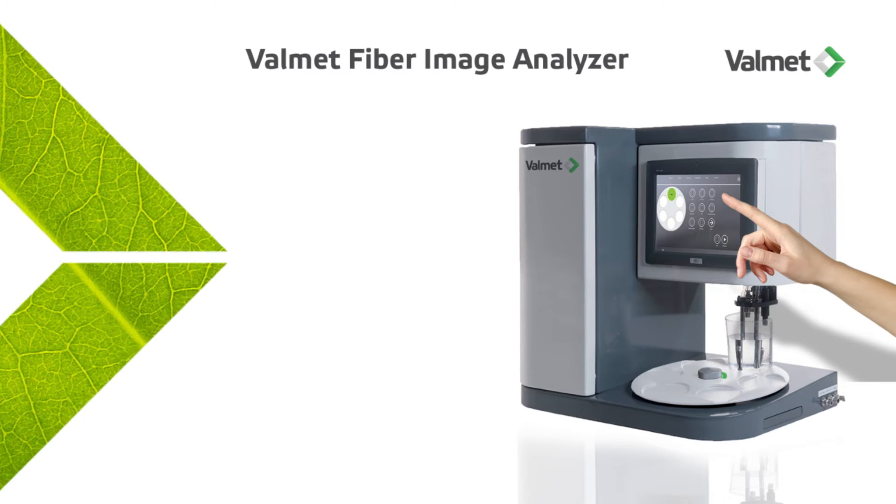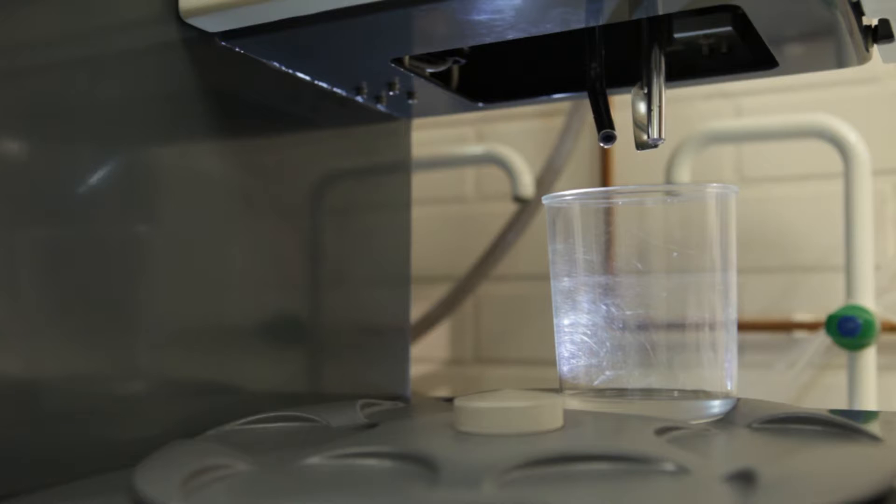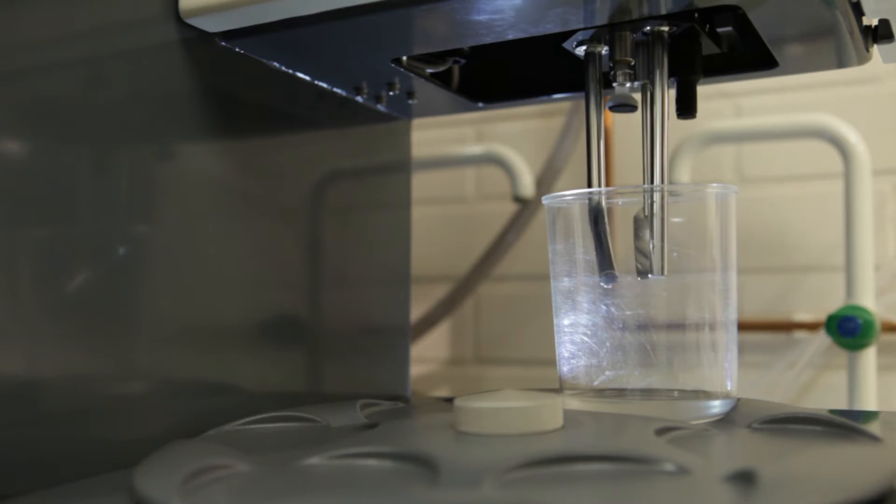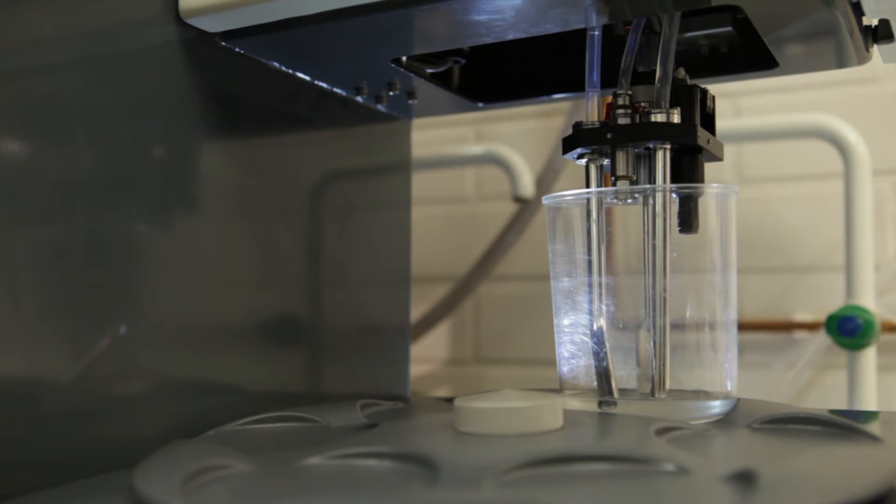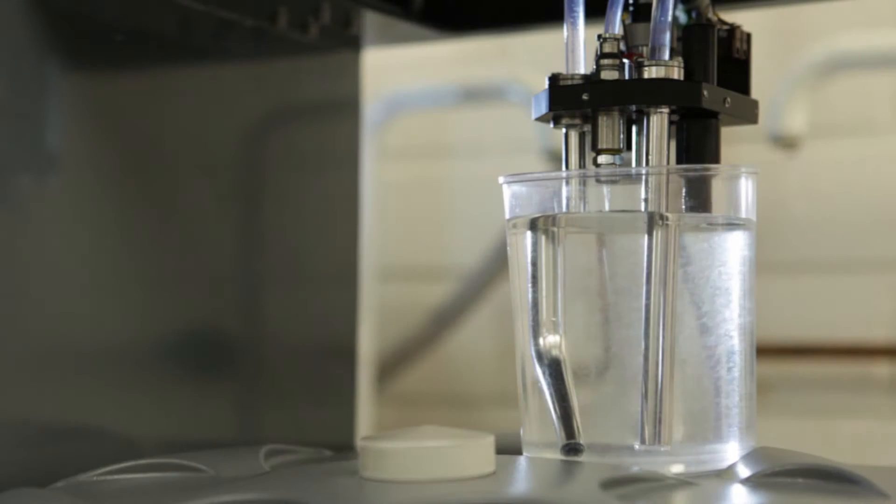The Valmet Fiber Image Analyzer, or the Valmet FS5 as we like to call it, is the fifth generation automated fiber analyzer from Valmet. It is packed with new technology and new features that bring fiber analysis to a whole new level.